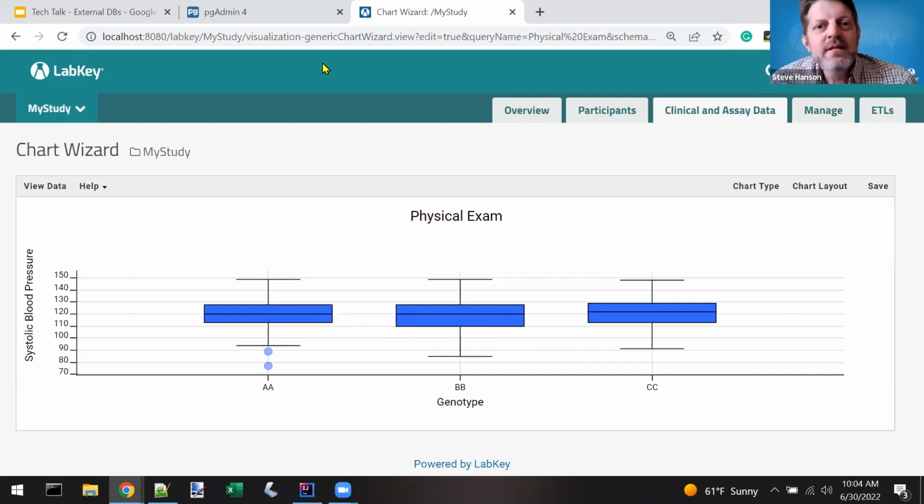Questions out there? Well, I'm going to lead my own Q&A session here. Let me look. I've got a couple of questions here. One of the users asks, where would you edit the schema? Is it in Tomcat? And I think, if I get your question, where would I edit the schema?